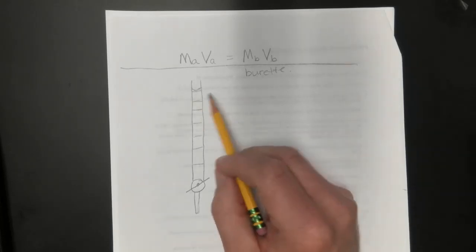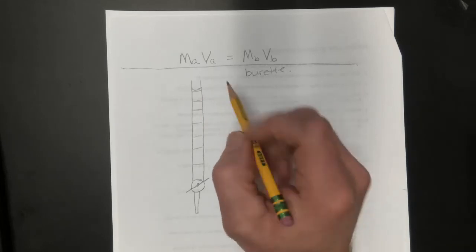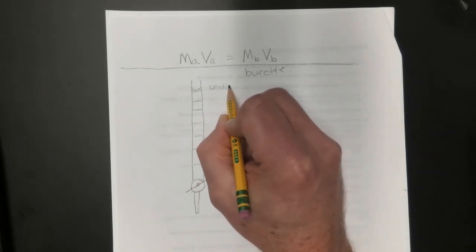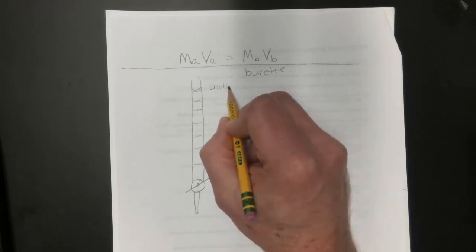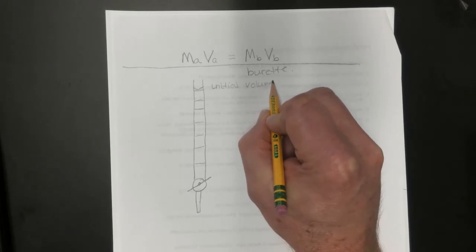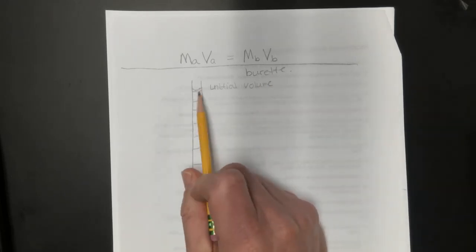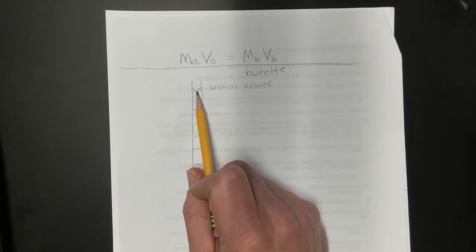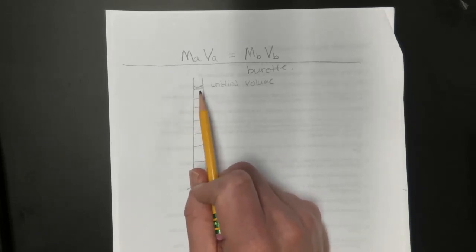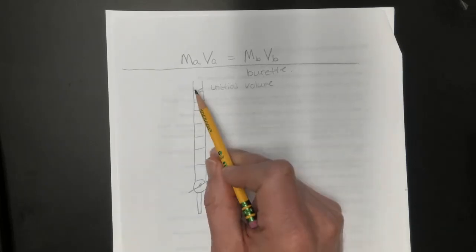So up here is the initial volume. You read the initial volume on the burette, and you have to read it to the correct precision. I'm not going to tell you. I'm just going to show you the graduations and where the meniscus is in the experiment. It's up to you to determine the correct precision. So you take the initial volume.